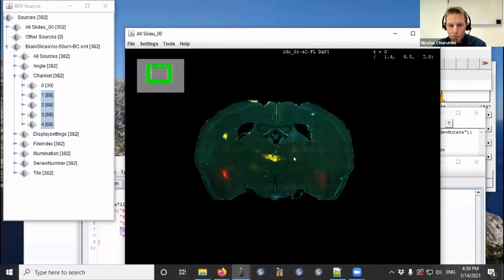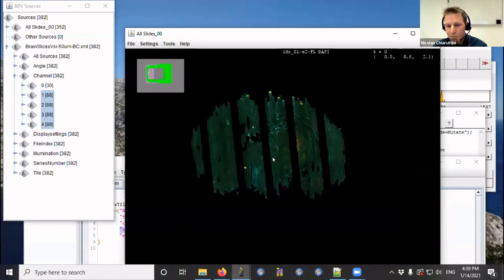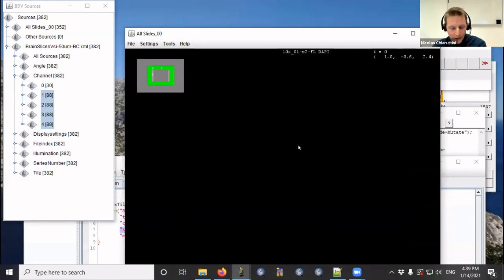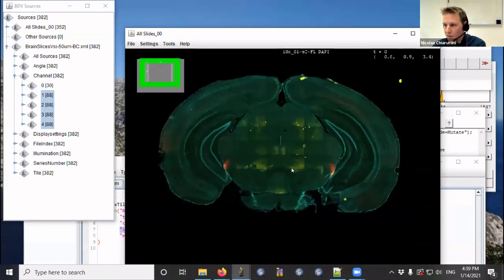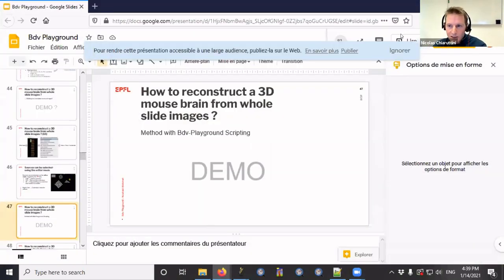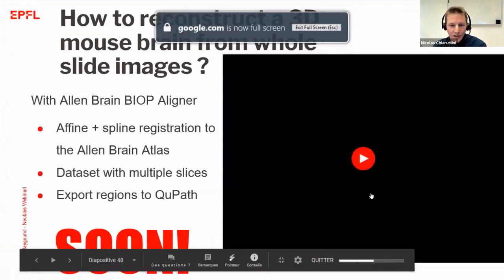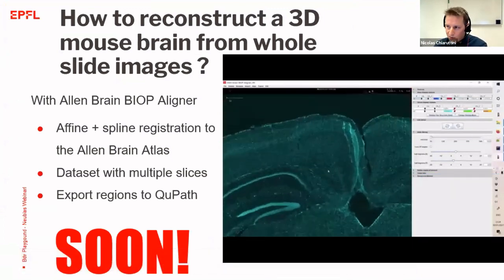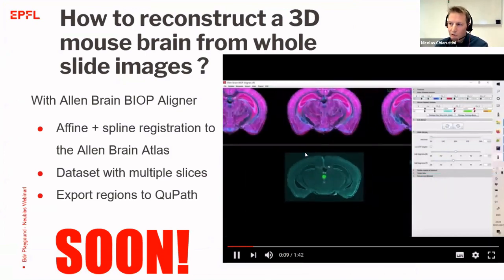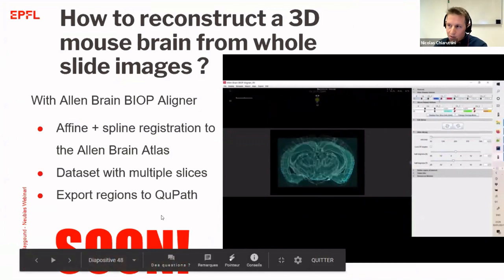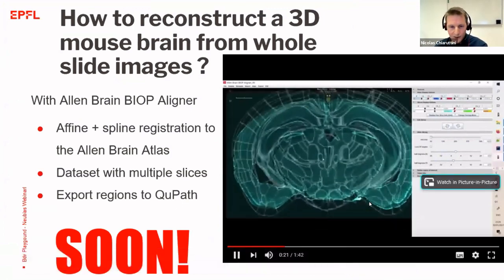Once stacked, zooming in shows individual cells within their 3D context. Since BDV is not restricted to 2D, you can rotate the volume and see the reconstructed brain from the side. The alignment is not perfect here since it's a simple stacking, but a forthcoming plugin will allow affine and spline transformations per source, registration to reference brains like the Allen Brain Atlas, and exporting regions identified in QuPath.